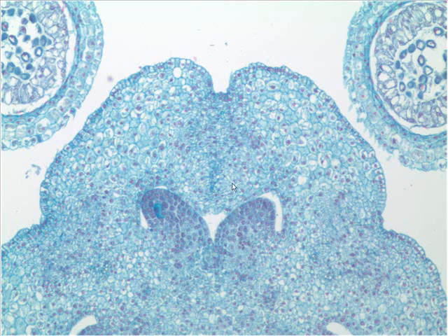Final picture. We're in the middle of the flower, so we're at some part of the what? Pistil. And so we can see here, however, we're pretty low on the pistil, because I can see a couple baby somethings here. What are these? Baby what? Ovules, baby ovules. And so this out here must be the what? The ovary. If it all had gone well for this little flower, if these ovules had developed, they would have developed into what? Seeds. And the surrounding ovary would have developed into what? Fruit. That's it for this one, ladies and gentlemen.